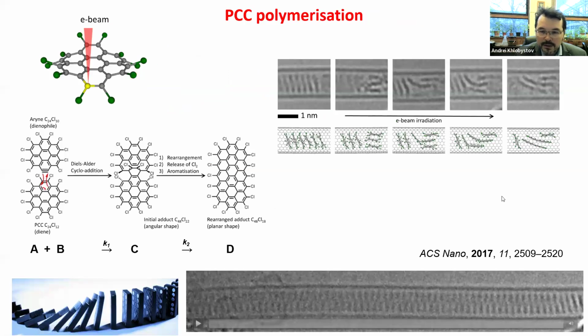We can pack these perchlorocoronene molecules inside the nanotube like you would put Pringles crisps in the tube. In fact, I think it's a very good comparison, because the PCC is not completely flat. It's slightly warped, just like a Pringle crisp.